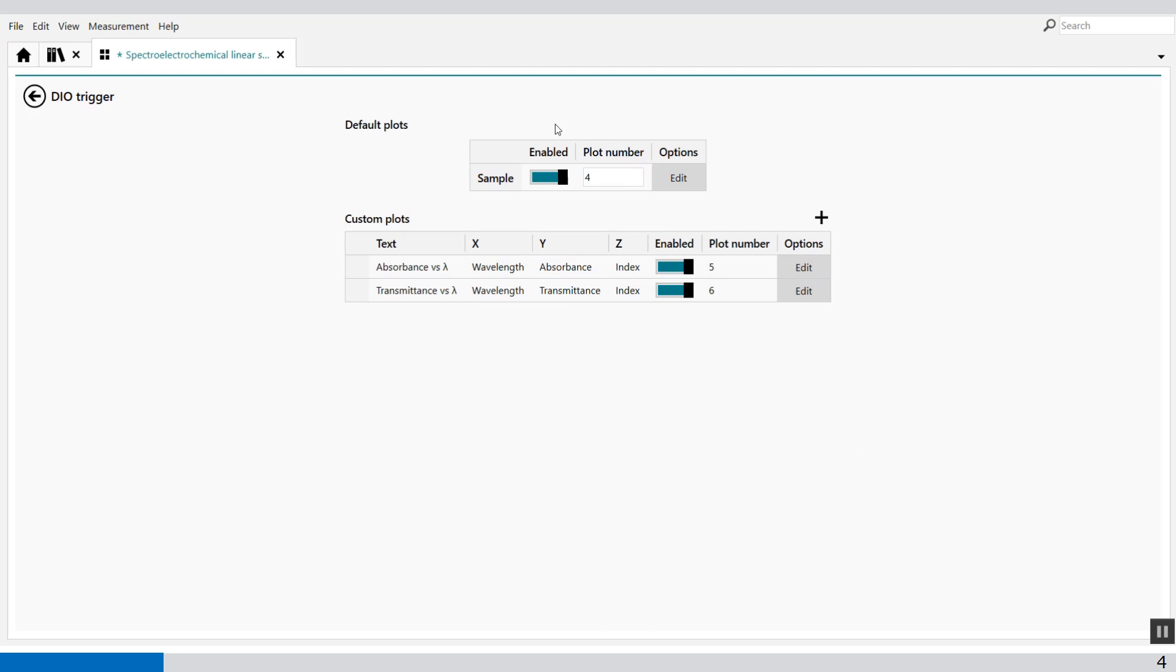In the More button, you'll see the sample, the raw data file. And then in plot number 5 and plot number 6, you'll see the absorbance and the transmittance.